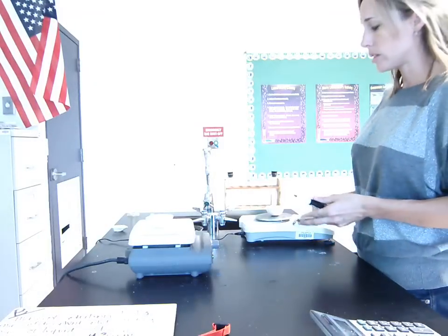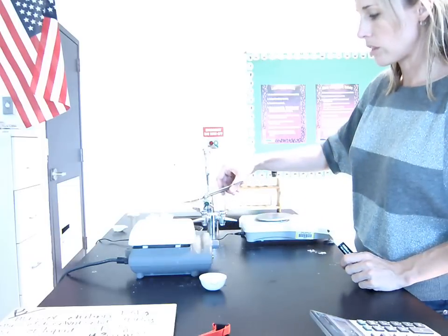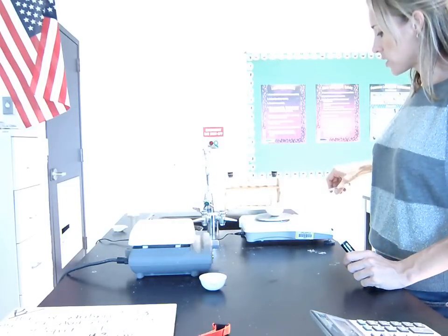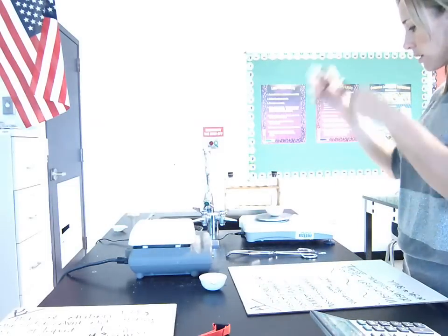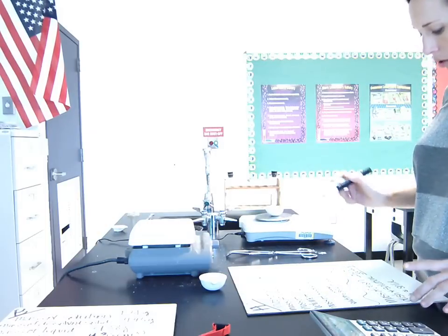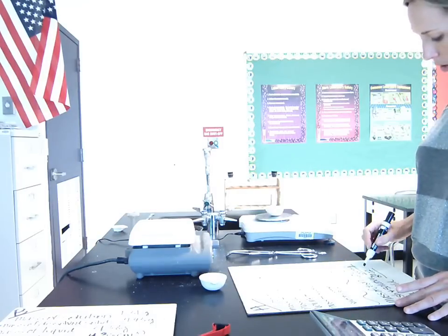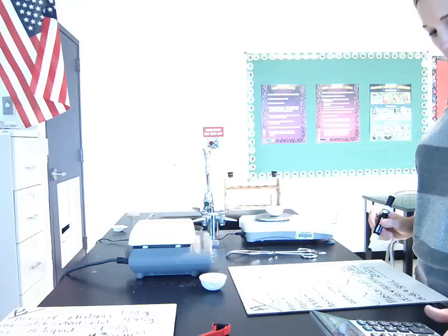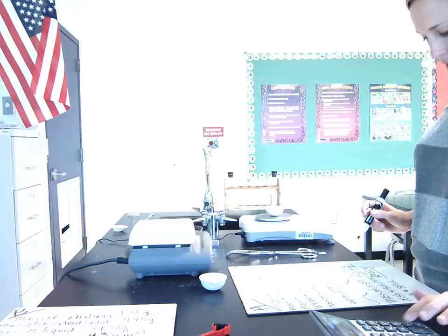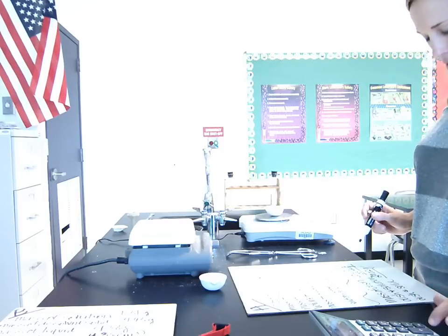Okay, let's go through and do A really quick. The discussion for substance A doesn't need to be quite as long because I gave you pretty much the gist of it with that one. So we're going to find the mass of the dish plus the remaining solid. Substance A also has a lot of white solid left over in the dish once all the liquid was removed. Okay, so the mass of the dish plus the solid together is 29.02 grams. And if I subtract out the mass of the dish, that's 29.02 minus 26.59.